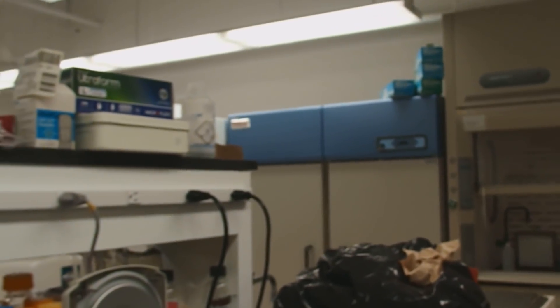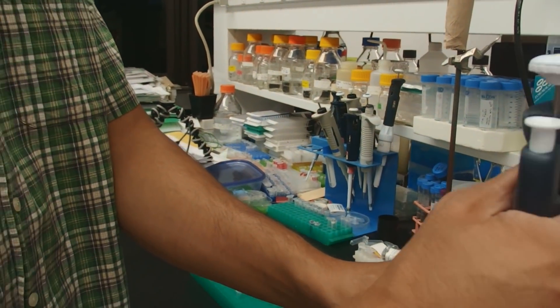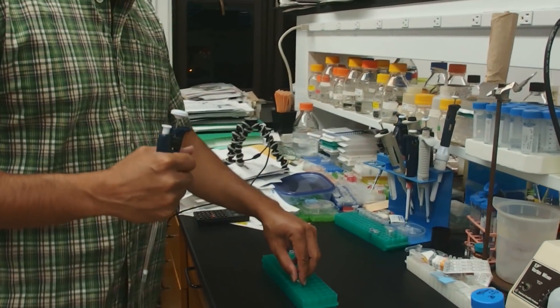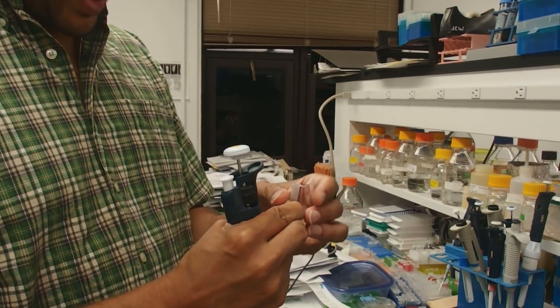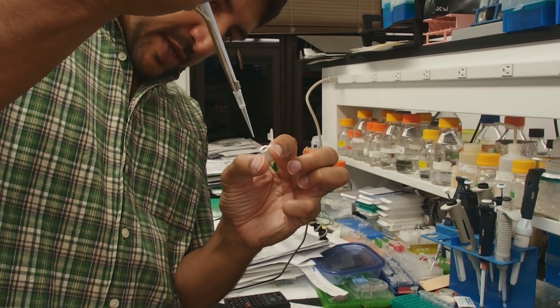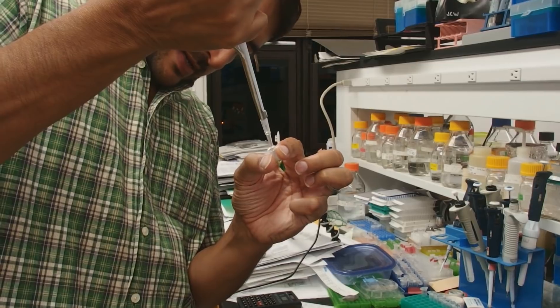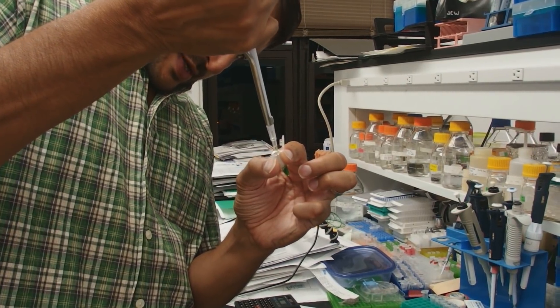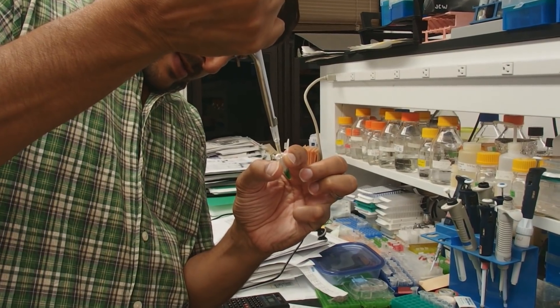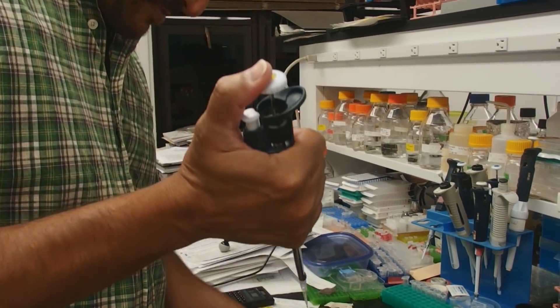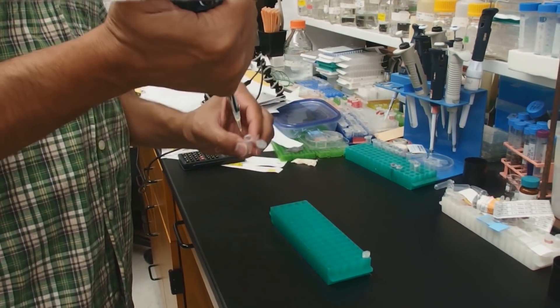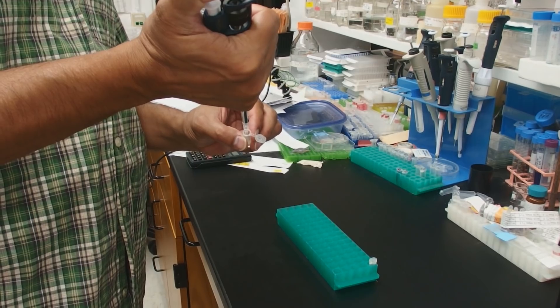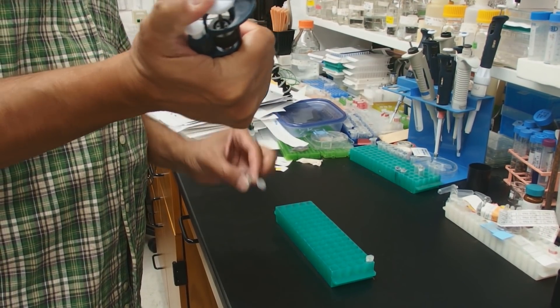We want to take that upper aqueous phase and put it in a new tube. You'll usually get a little bit less liquid than you started with, so whatever CTAB you started with, you'll probably get a little bit less than that. And we really don't want to take any of the interphase. It's better to leave a little bit of stuff behind than it is to be greedy.